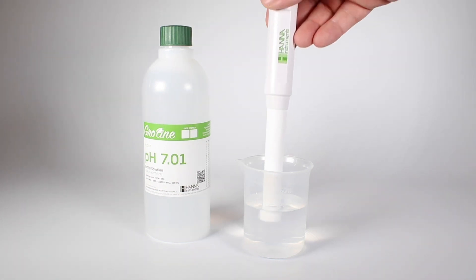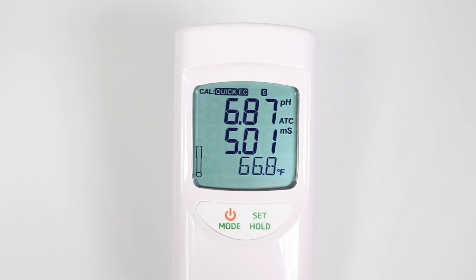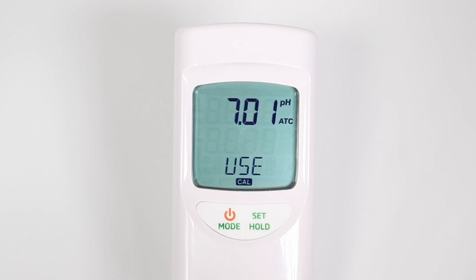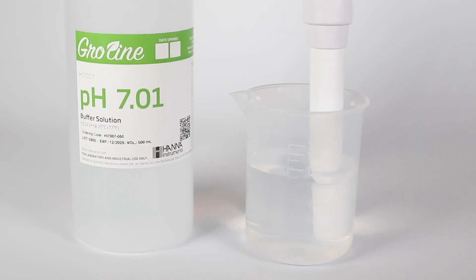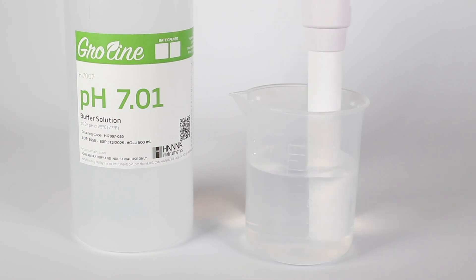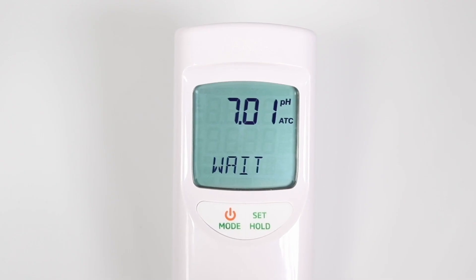Place the probe in the pH 7 buffer. Hold mode until cal standard shows up, then release the button. If the buffer is recognized, REC is displayed. Then wait will blink until the calibration is accepted.